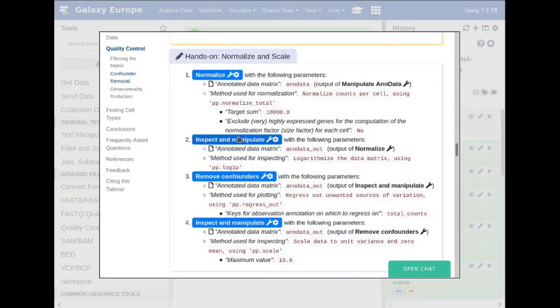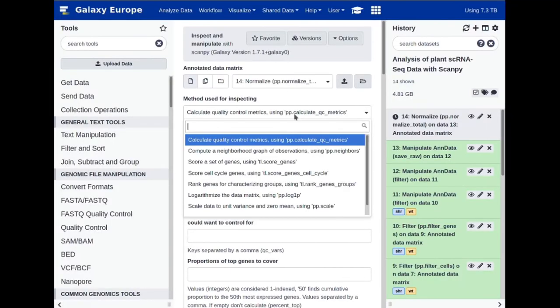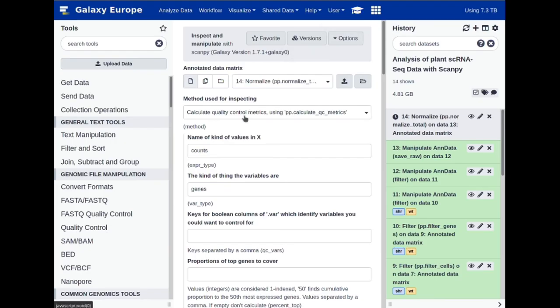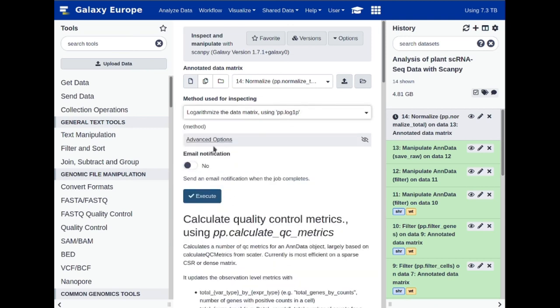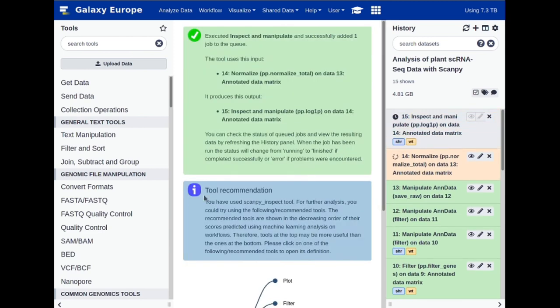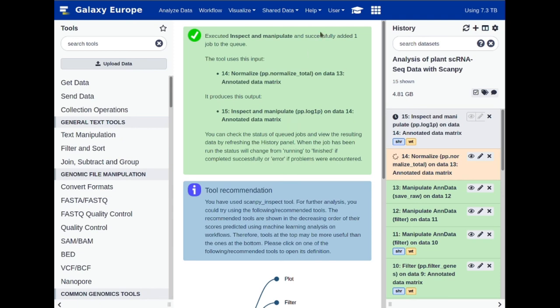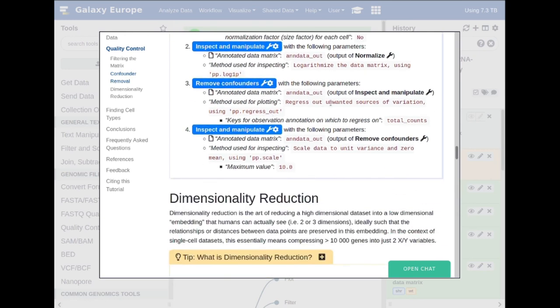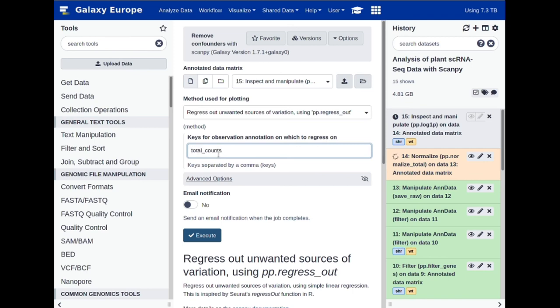Then we wish to perform a log transformation on the data. This ensures that large differences in gene expression profiles are not too drastic enough to completely drive separation of a data type — we are looking more at gradients rather than absolute differences. By performing a log transformation, we compress this variability into a tighter space. Then we wish to regress out unwanted sources of variation; the main one in our dataset is simply the library size, so go to 'Remove Confounder', select 'Regress Out', and click on 'total_counts'.